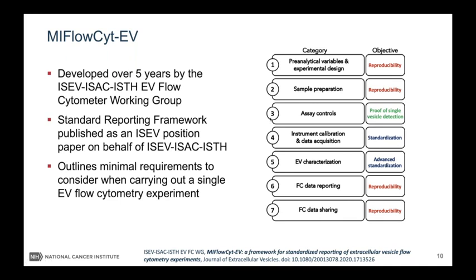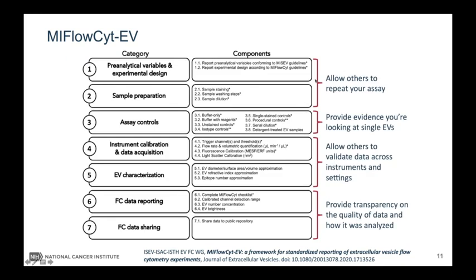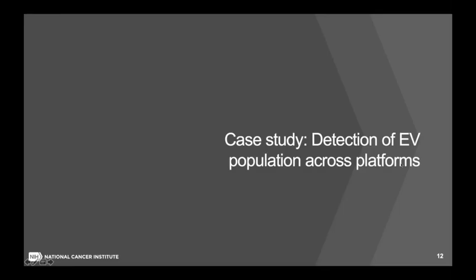And although this framework has been laid out for flow cytometry specifically, most of these can be utilized on other optical instrumentation. And ideally, this kind of framework would be developed for most characterization techniques, if not as a learning resource, but just to outline the things that we need to be aware of. And we can perform all of the controls needed to know that we're detecting single particles, but until we perform instrument calibration and define our instrument collection parameters, others won't be able to validate our data. So it's really important that we're transparent and we calibrate our data.